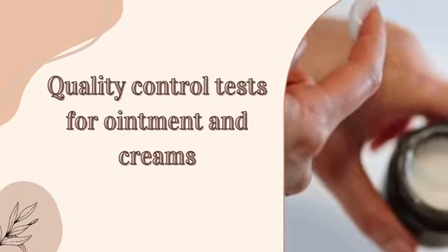Quality control tests for ointment and cream. Introduction.